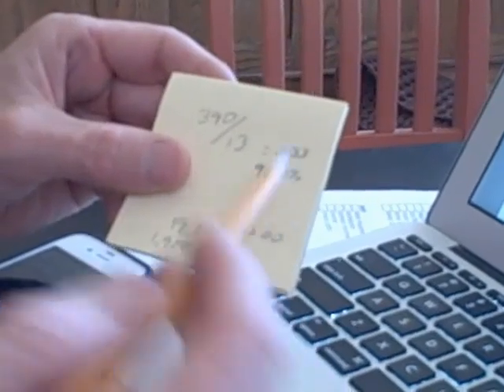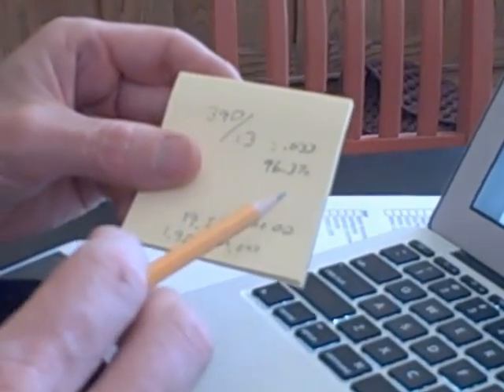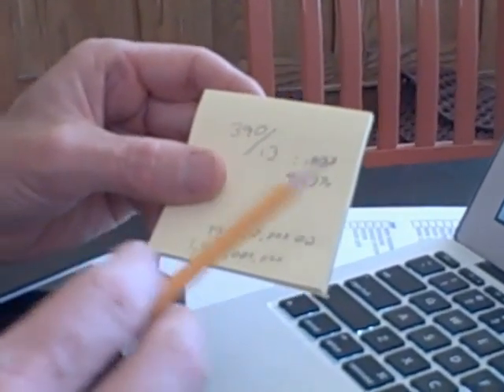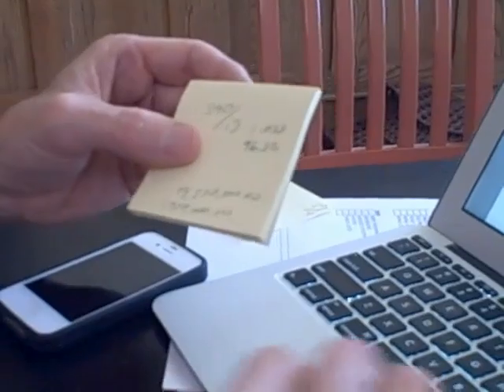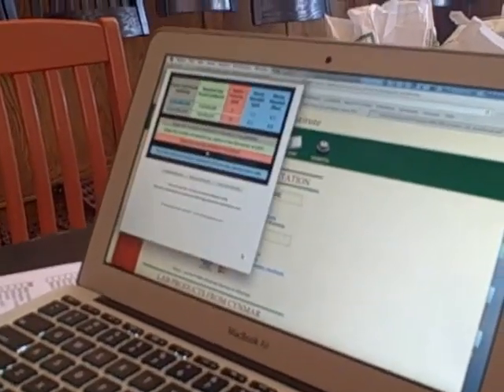We're okay there. Now we need to figure out how much yeast we're going to pitch for a beer we're going to brew. So I go back to the Brewing Science Institute's website, and they have a pitching rate calculator.